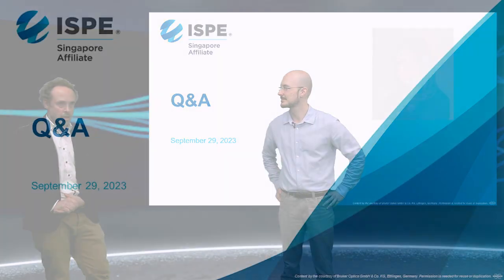This is where we do the real authentication and quantification, and we have the best experience here. That's why we are mostly following up with NIR spectroscopy. But of course, it's as well possible with Raman spectroscopy. Perhaps Mui, you want to spend a few words on that topic?